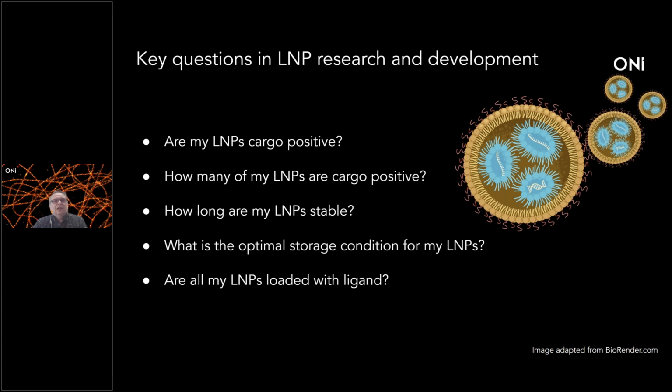And if you have lipid nanoparticles which contain cargo, and you are measuring the concentration of cargo over time to study your storage or stability, you might still get the same information about the level, but maybe your RNA or any other cargo is actually outside of the lipid nanoparticle.